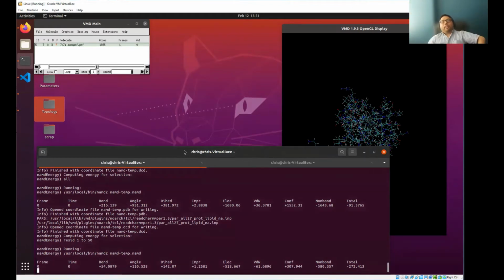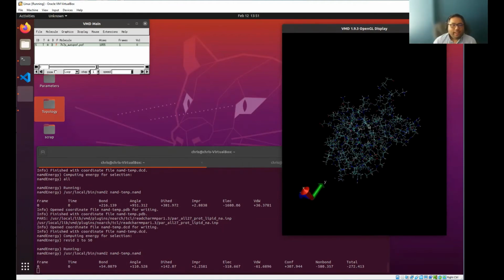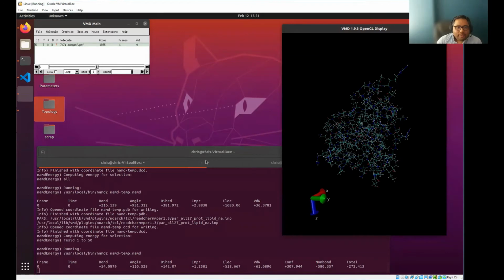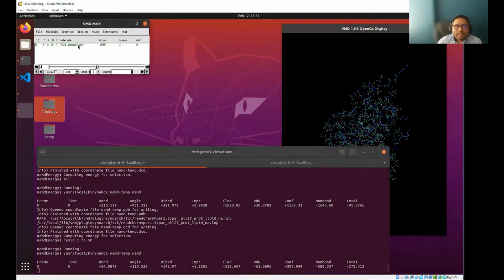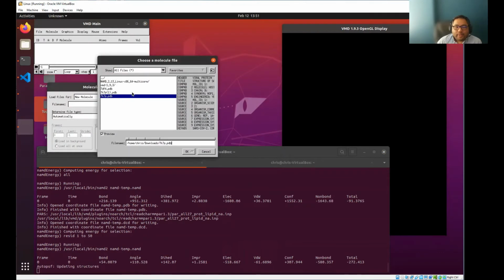So far we've been working with proteins in a vacuum, basically, right? But as we all know, that's not real life. You're typically going to be working with proteins in an environment, like a solution or something like that. You want to model and simulate and get data from a more realistic environment. You can do all that in VMD. So let's go ahead and clear all this out and load back in our original PDB file.